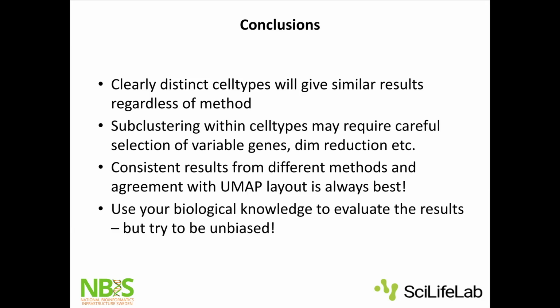So that's it. Do we have any questions on clustering? I was wondering, can you also cluster based on a gene set that you select? That you make a gene set and then do clustering? And does that make sense in some cases? It does make sense in some cases.